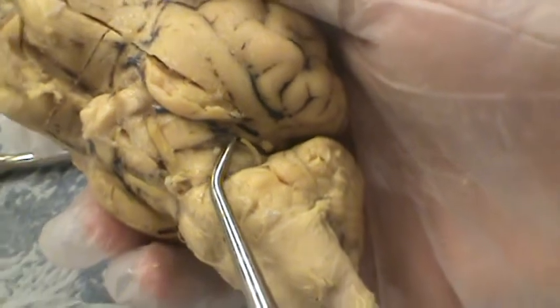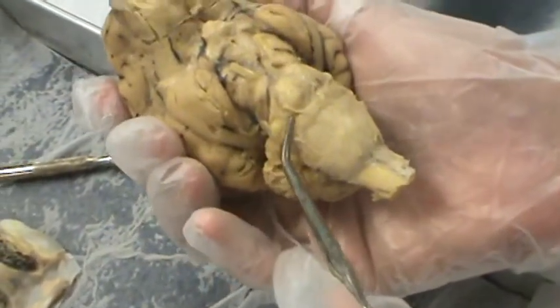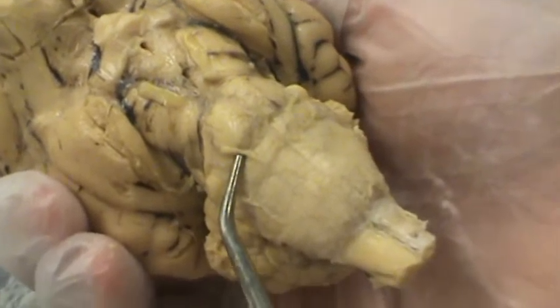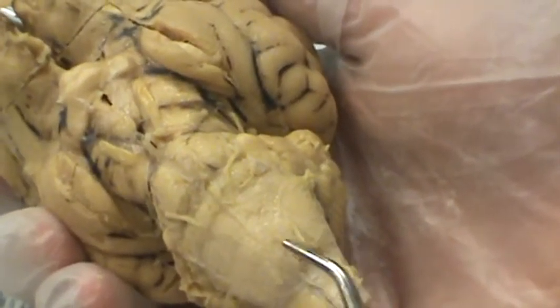And then the trigeminal is the lateral side of the pons, which is this flap right here. That's the trigeminal. And the abducens is on the base of the pons, which, I believe, is there. It's the last one.